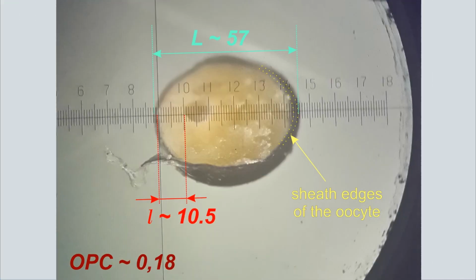Let's see how it looks on the real eggs under a stereo microscope. This is a winter fish, from which it was planned to obtain eggs out of season, and accordingly the sufficiency of wintering was evaluated. As we can see, not quite enough yet. A characteristic sign of this is that the germinal vesicle is almost completely located in the area of coarse-grained yolk.